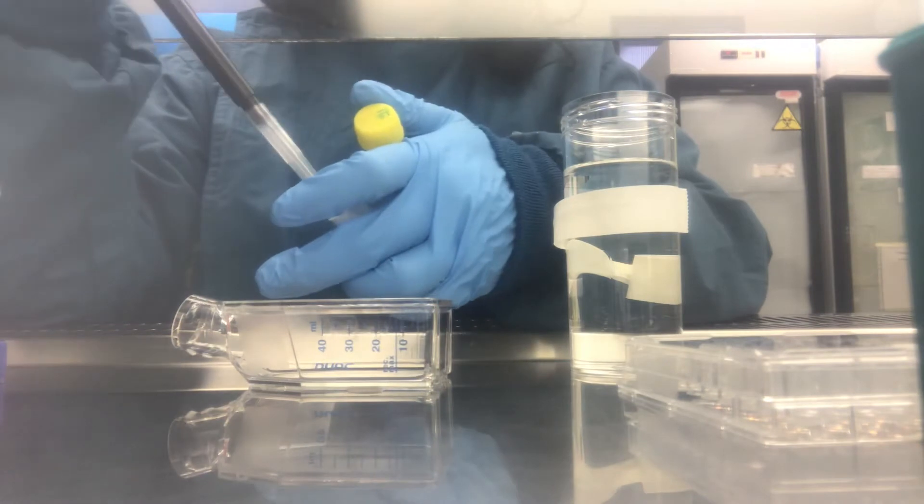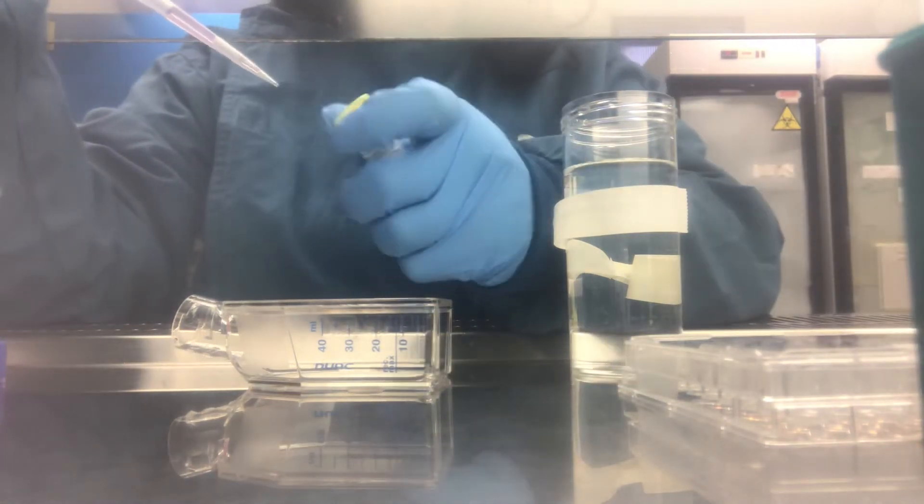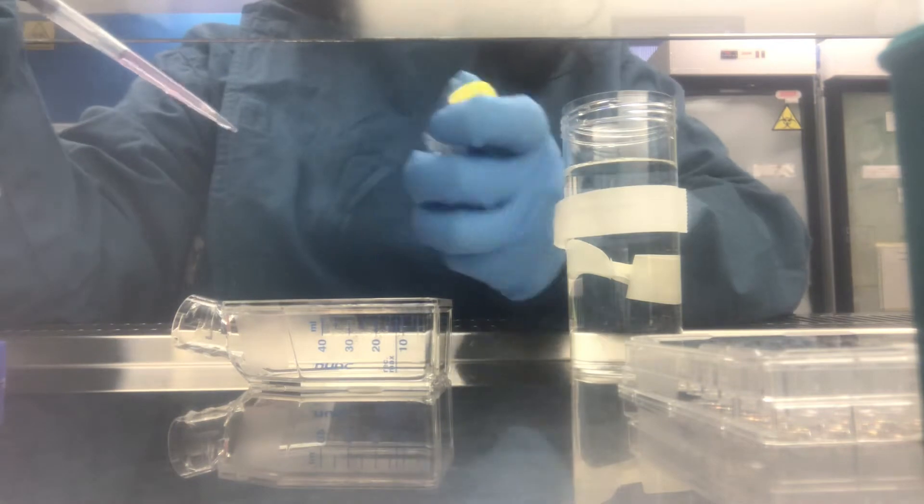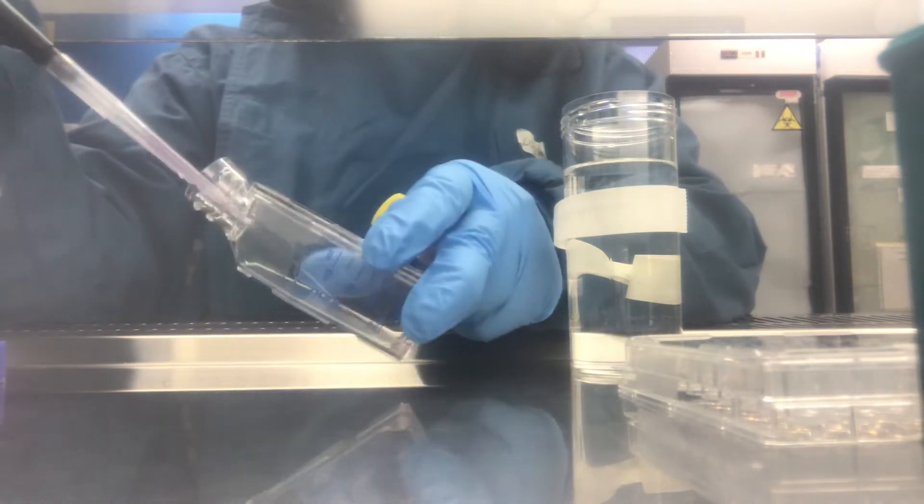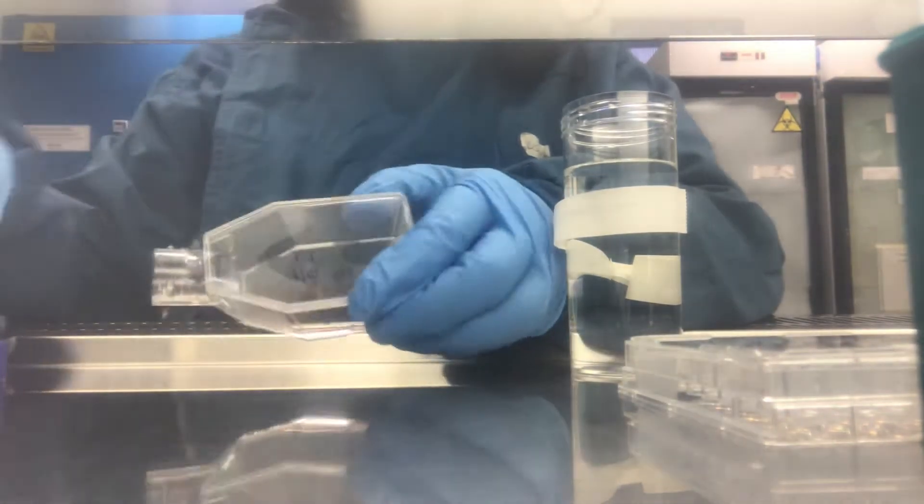Now you add trypsin. I'm adding 0.5 ml for this flask, which is a 25 centimeter cubed flask.